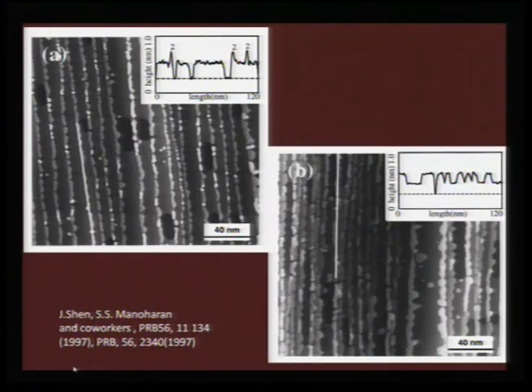And what can I do with this from the cartoon that we saw in the earlier slide? We can use the same information and then try to calibrate how the iron is growing on this copper 111 surface. As you see here, this is iron on copper grown using a thermal deposition, and when you put some iron atoms, there is a step decoration that is happening. Only at the edge of these terraces, iron atoms are going and sitting.